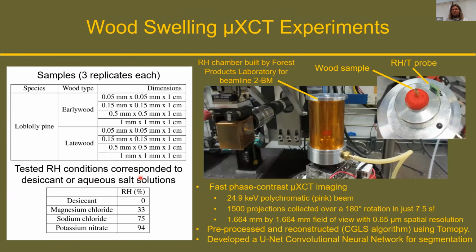So to study swelling in the wood cellular structure, we built a humidity chamber at the FPL machine shop that fits inside of 2BM. In this case, it's a pretty simple capped tube with two machined aluminum caps. And here's the hose that feeds in the humidified air from the humidity generator. And here's our sample inside of there, as well as the humidity and temperature probe to measure the conditions during the experiments.